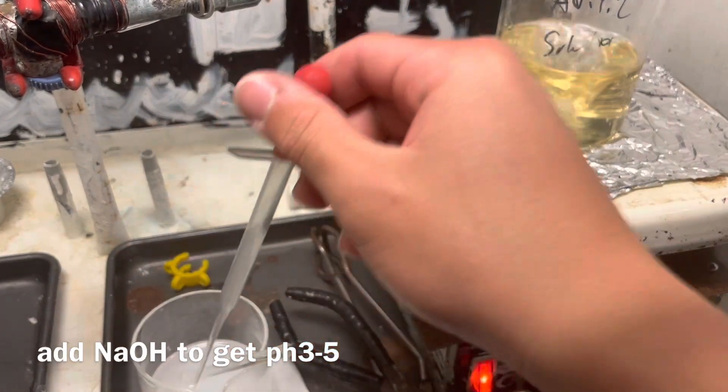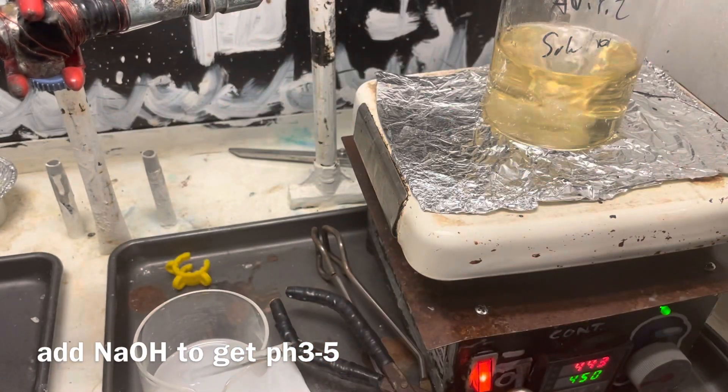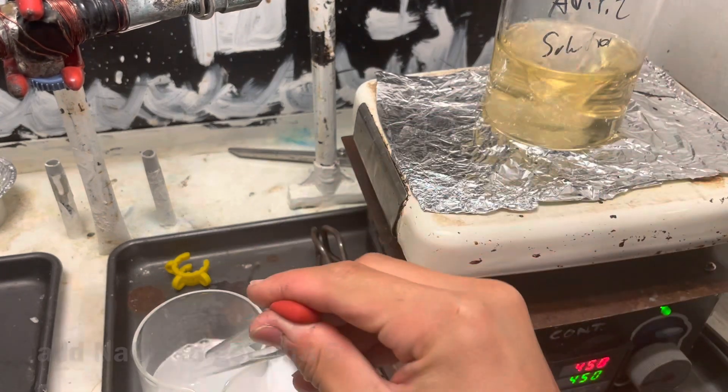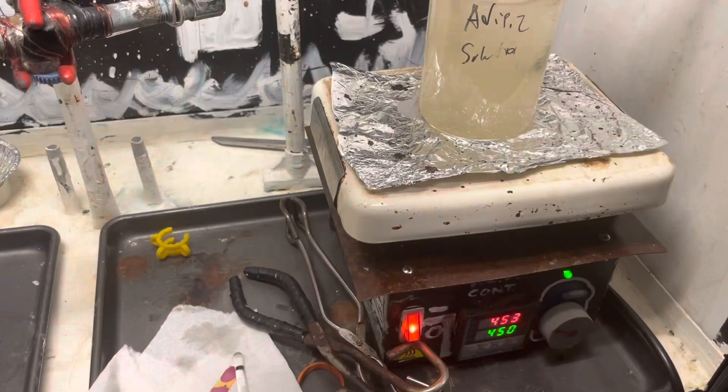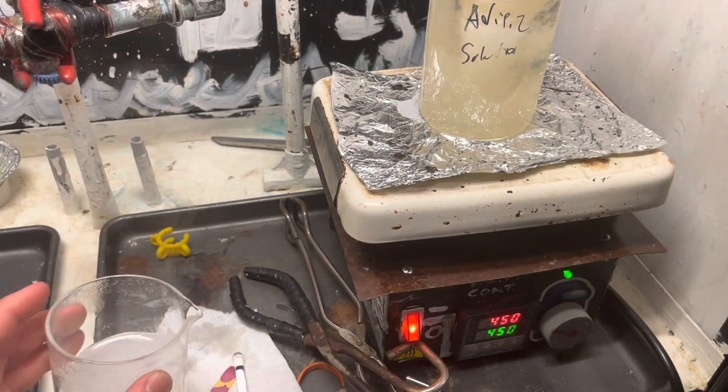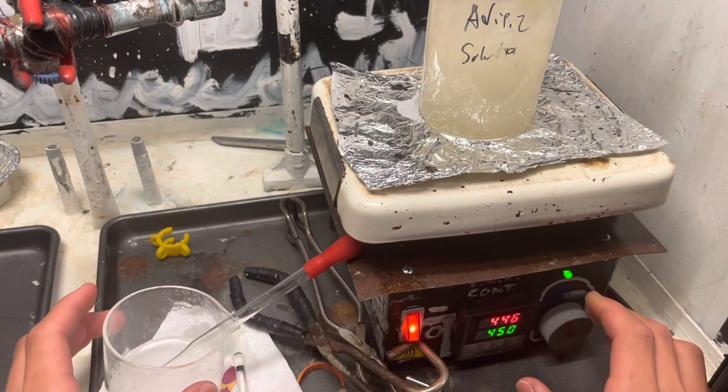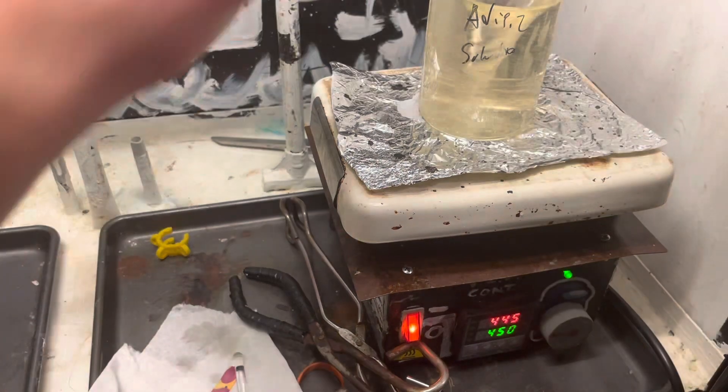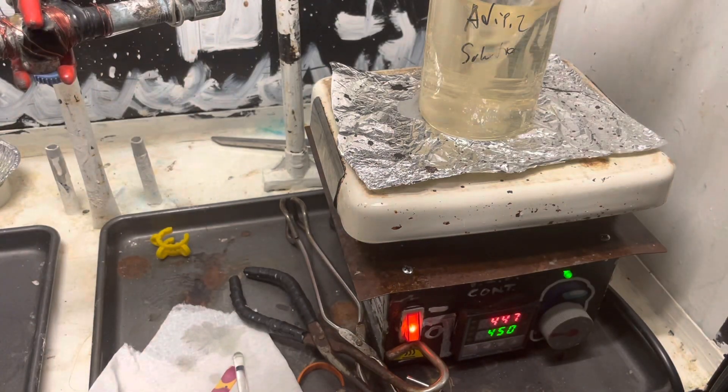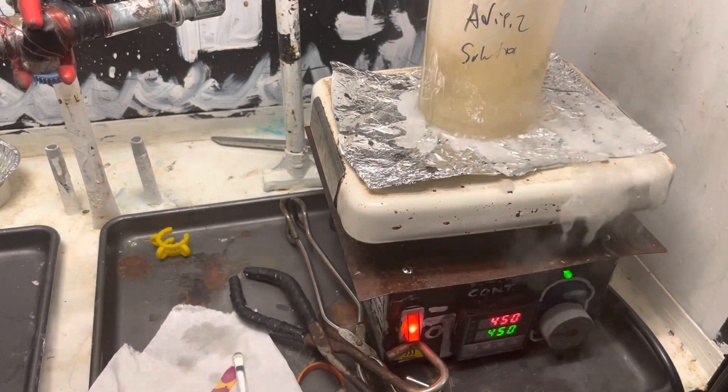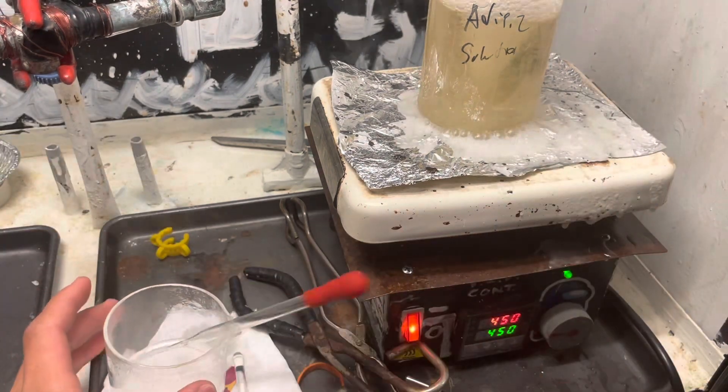Take your filtrate, and now neutralize it with sodium hydroxide to a pH of 3 to 5. The reason why we're aiming for this specific pH is because this pH seemed the best for the adipic acid to precipitate out, and also sodium sulfate, but still maintaining adipic acid in a non-ionized form, so it's not water-soluble. Well, more water-soluble than the salt.